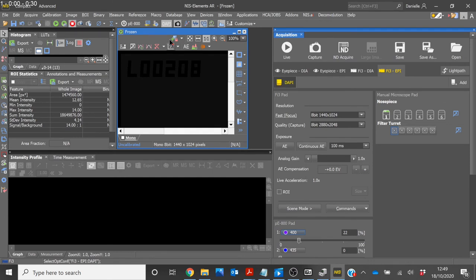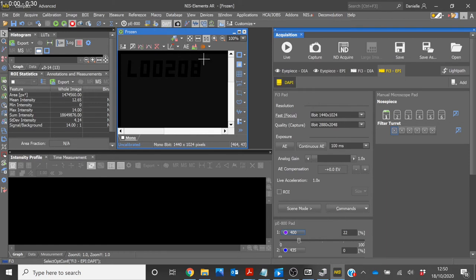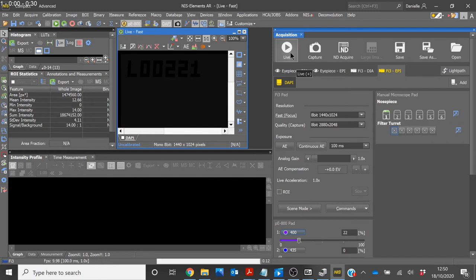You will notice that a DAPI icon appears on the toolbar. Here you can select DAPI, go live and the 400nm LED will illuminate.